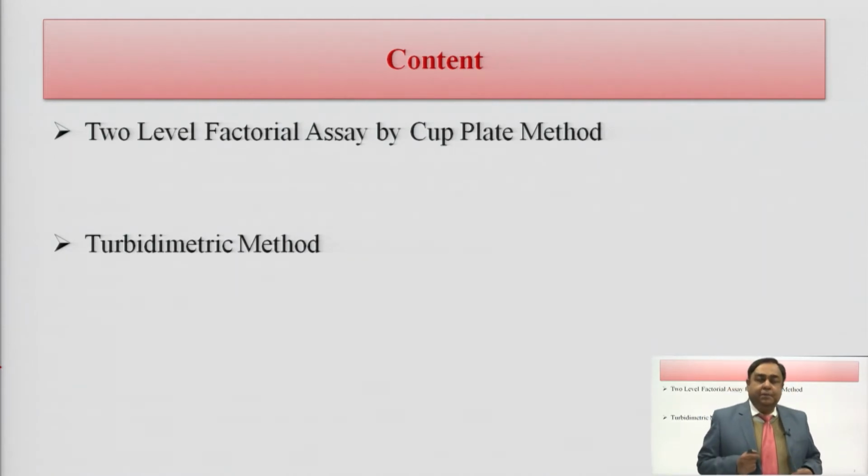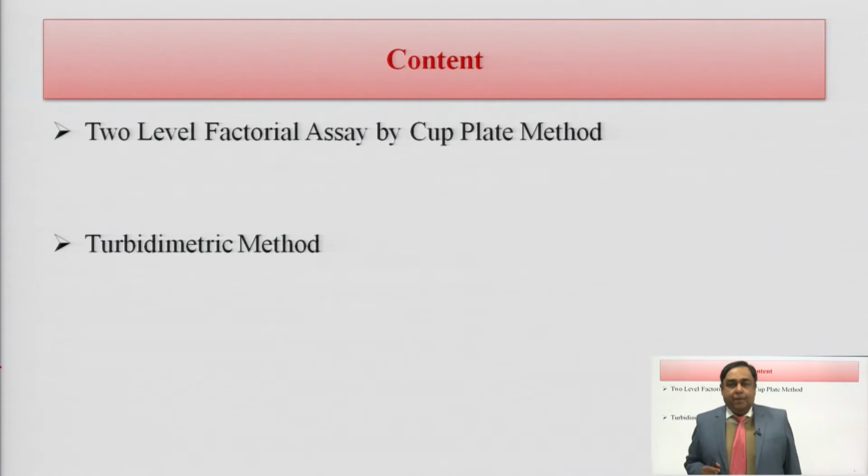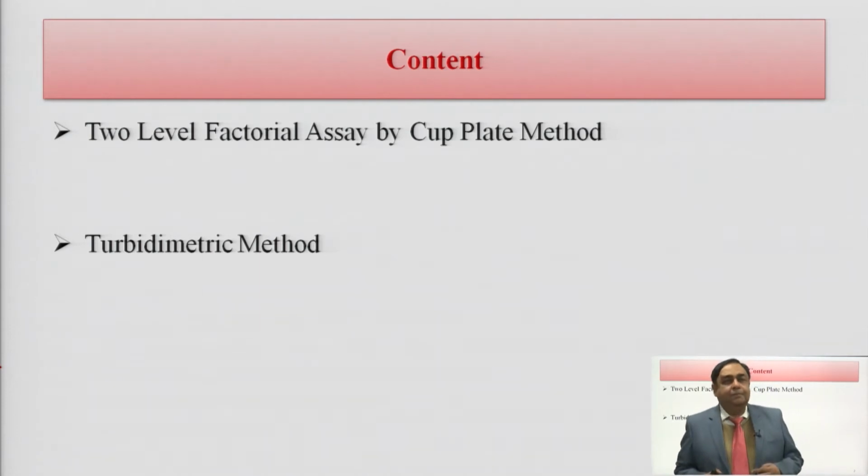What is the principle? Here in cup plate method as well as in turbidimetric method, we are estimating the degree of inhibition being produced by the antibiotic.